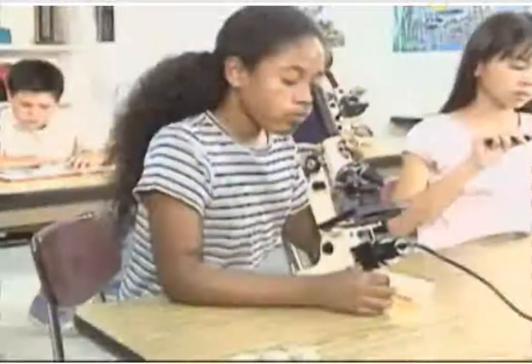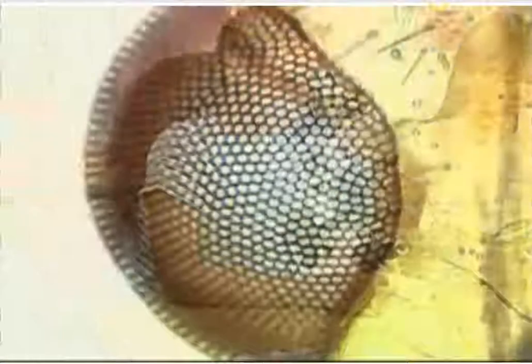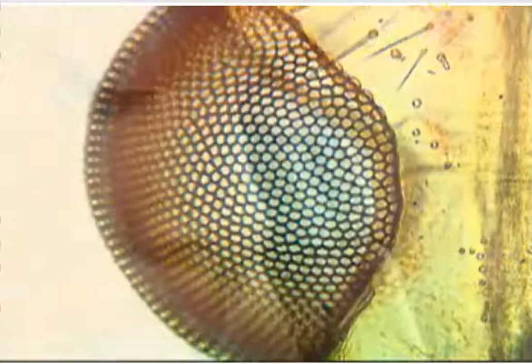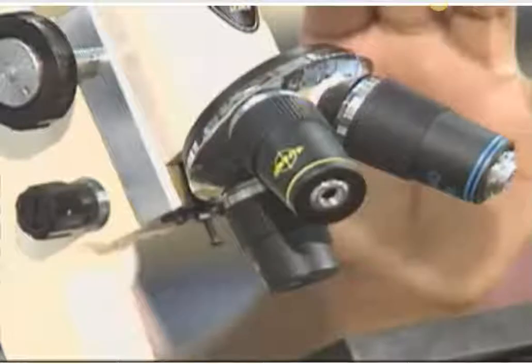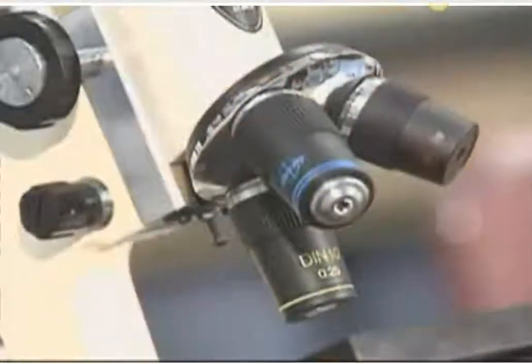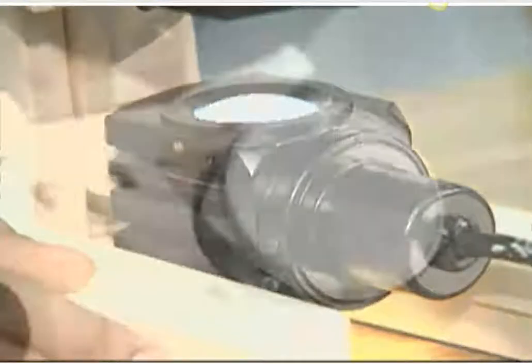Standard light microscopes are even more powerful than stereo microscopes and enable us to see incredible detail in even minute objects. Standard student microscopes usually have a single eyepiece lens and a rotating turret that holds at least 3 objective lenses. Specimens for a light microscope have to be very thin so that light will pass through them. Specimens are illuminated from below with an illuminator or a mirror.